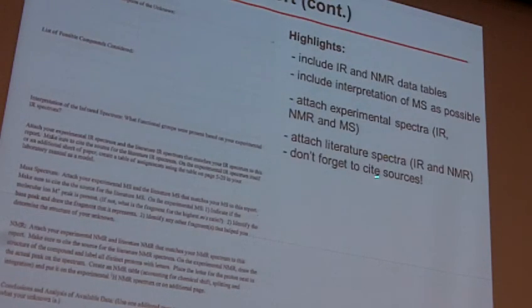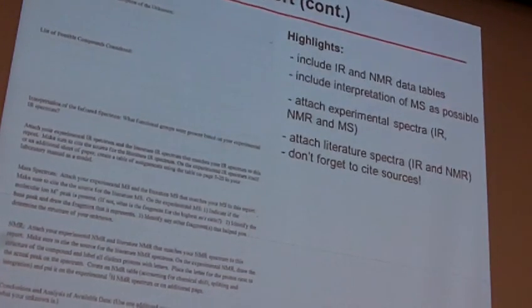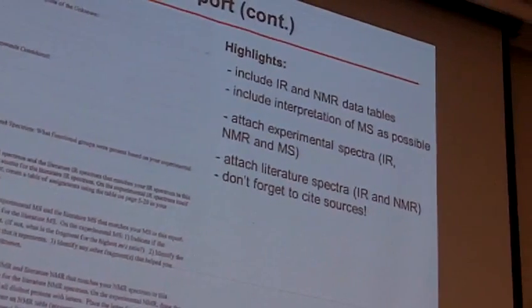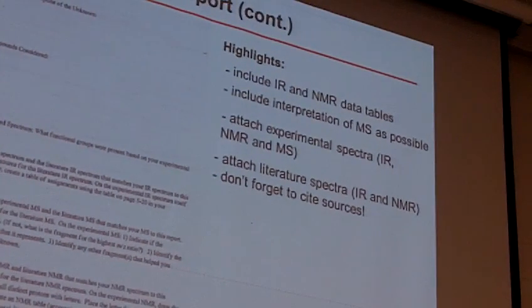Be sure, I'll remind you of this later, to attach the experimental spectra once you have those, and then attach the literature spectrum. Once you put all of this information together, the NMR, the IR, all of your other data, you should have a compound or two, a couple of things that you think your compound is. Take that, then go and look up the literature and see if they match.